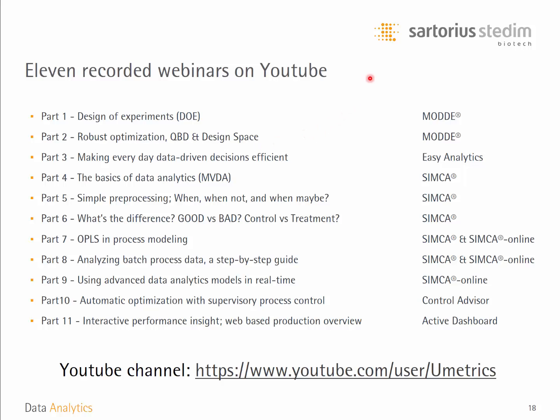If you would like to know more about the data analytics capabilities of the different software elements making up the Umetrics Suite, we have 11 recorded webinars on YouTube that walk through the different aspects of the suite. If you decide to embark on this series of 11 recorded webinars, you should know that there is a small learning curve when going from one webinar to the next. They are like links in a chain, but you can definitely also watch the recordings stand alone.